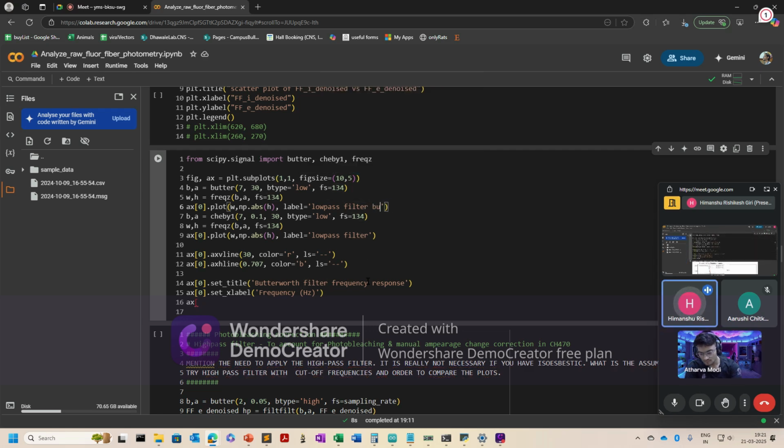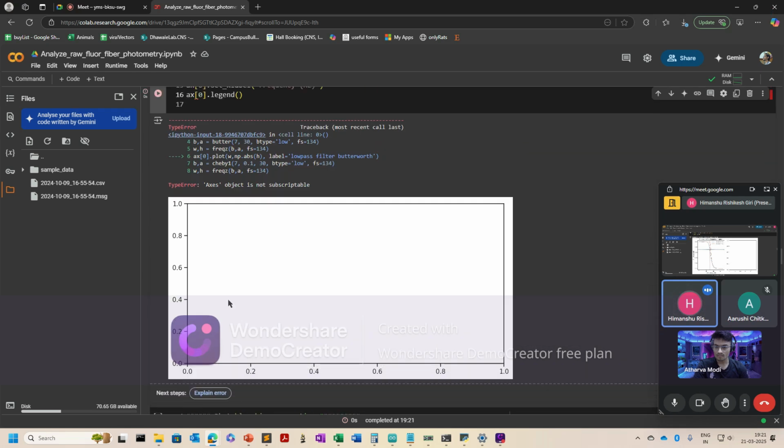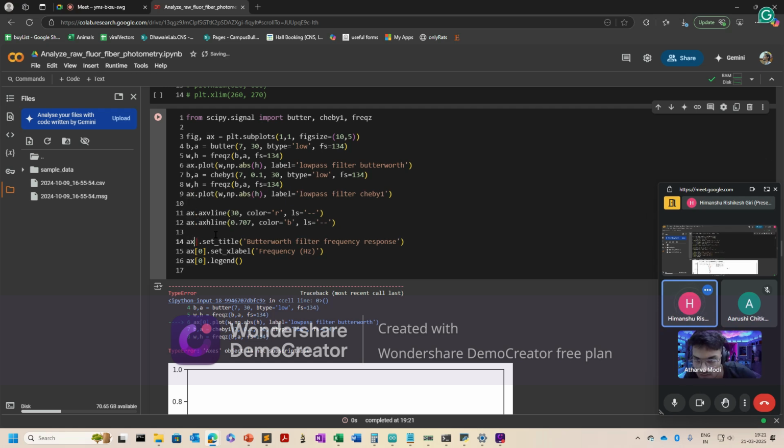Hmm. And yeah, order might also be different. I haven't checked. So let's say fifth order. It is hard to compare looking at it like this, but yeah. Yeah, done.